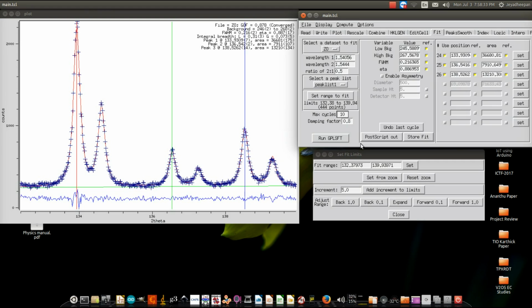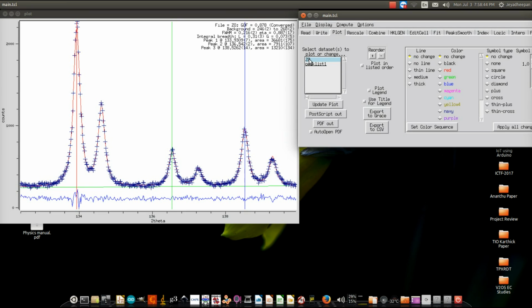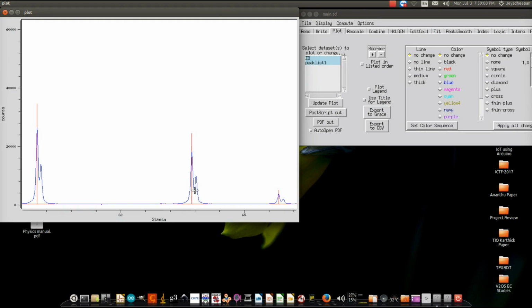so forward. So here I have 3 peaks together, last set of peaks. Set from zoom and peak, sorry, highlight this window, then only the peak will be enabled. Peak, peak and peak. So I have 3 peaks for refinement, and then position.